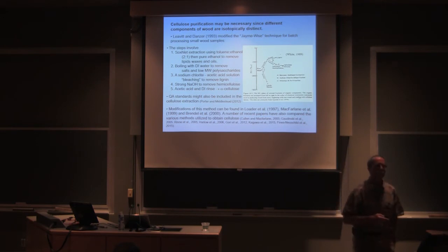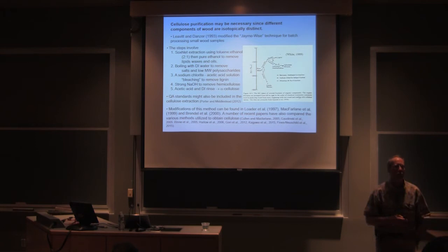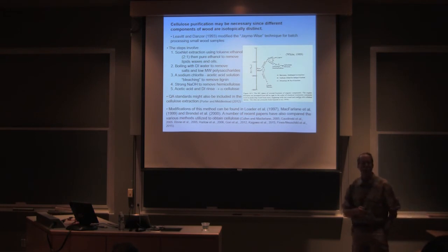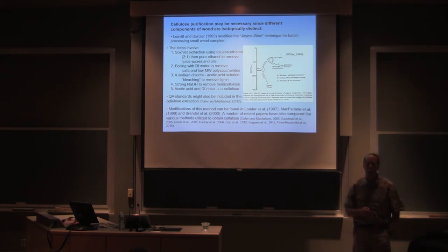Go ahead, it's fine. This might be a little bit off topic, but if you're looking at water samples that you extracted on the extraction line, and you have some of those resins in there, and then you're getting some of the deuterium and oxygen from those lipids, and being that they're mobile, do you have to incorporate that as skewing your results? Well, one thing, you better not run them on the Picarro.